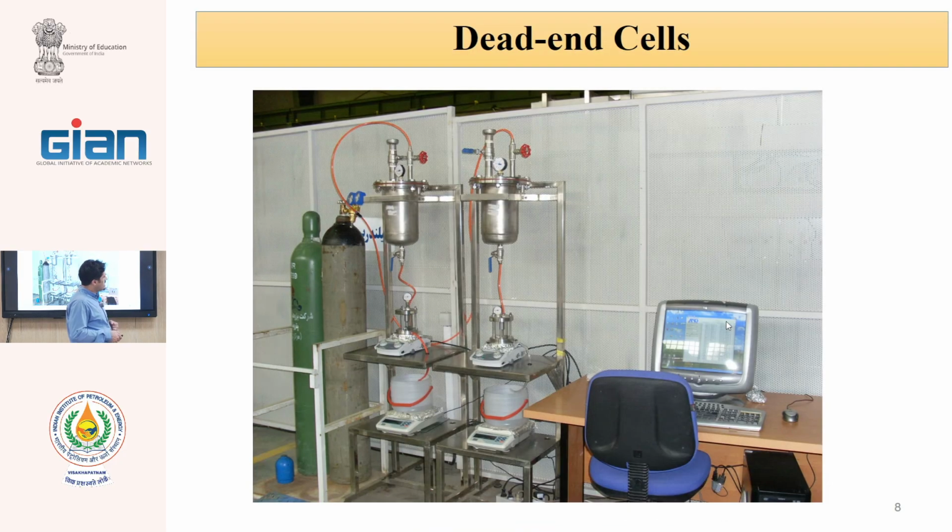Or here you see that for continuous measurement, the balance is connected to a computer, and there is no need for the student to stay here. After preparing everything, it automatically weighs the collected permeate. You see, the stainless tank is connected to a cylinder. Instead of a cylinder, we can use a compressor. We can increase the pressure with a compressor and there is no need for nitrogen.